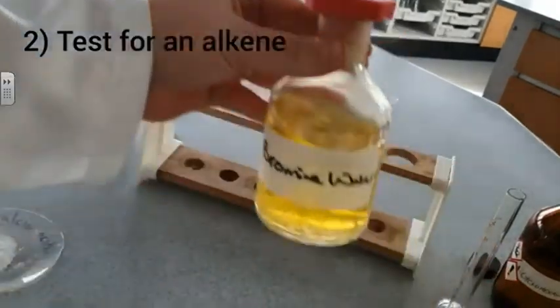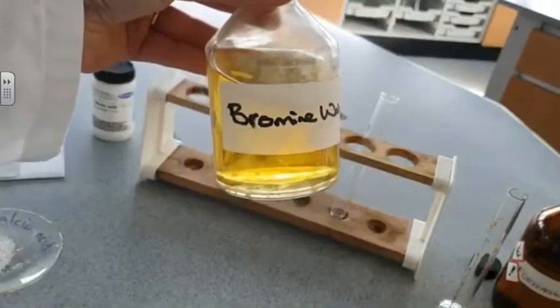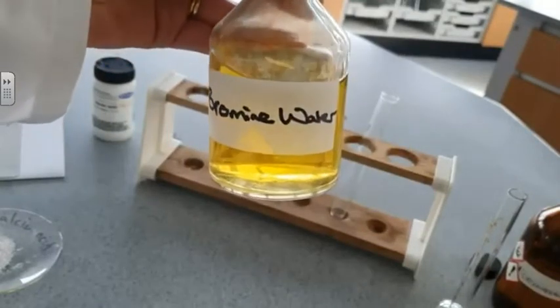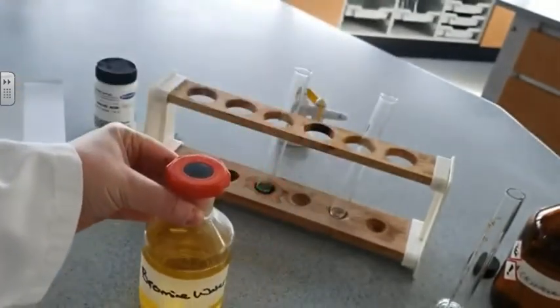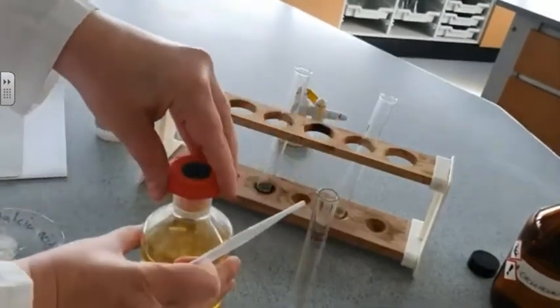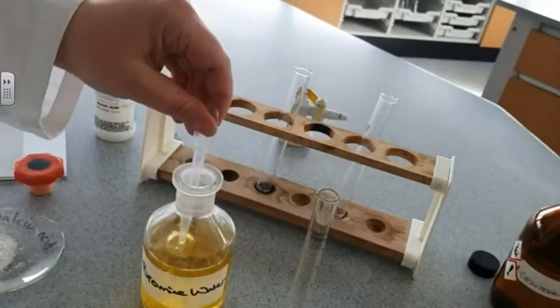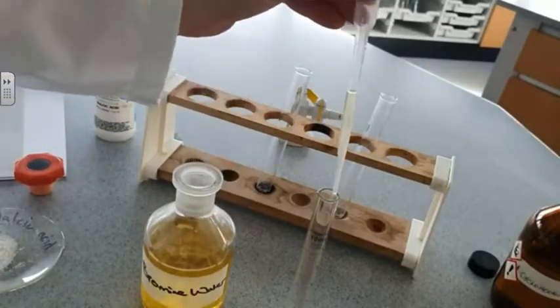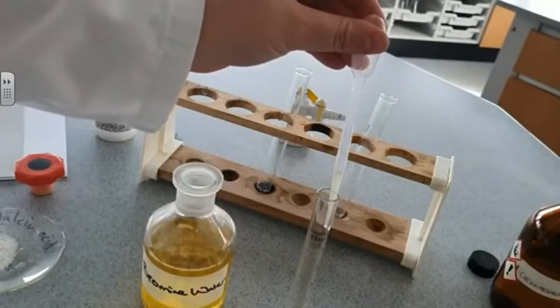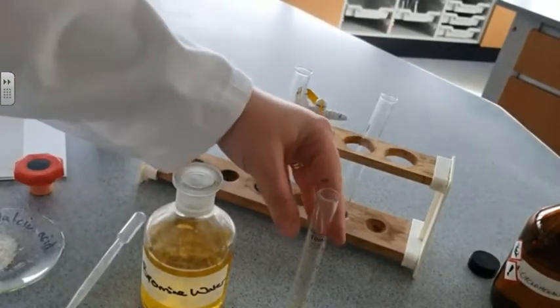Test 2 is our test for an alkene, and to test for an alkene you might remember from GCSE that you use bromine water. Bromine water is a yellowy orange solution, and when it reacts with alkenes it undergoes an addition reaction, and the bromine water is added to the alkene, and so the colour of the bromine water will disappear, often referred to as decolorizing the bromine water.